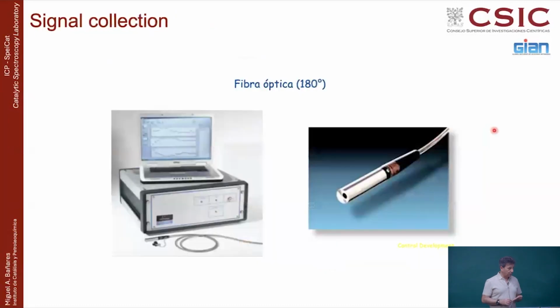You don't need a microscope. You can use fiber optic. And in the case of fiber optic, things will look very simple, and then you can basically measure from the tip of this fiber into the sample. So you can go like if you had a microphone, just looking at different samples. And that is very convenient. And you can even put a microscope objective here, even if you don't get the image, to maximize the signal where you measure.